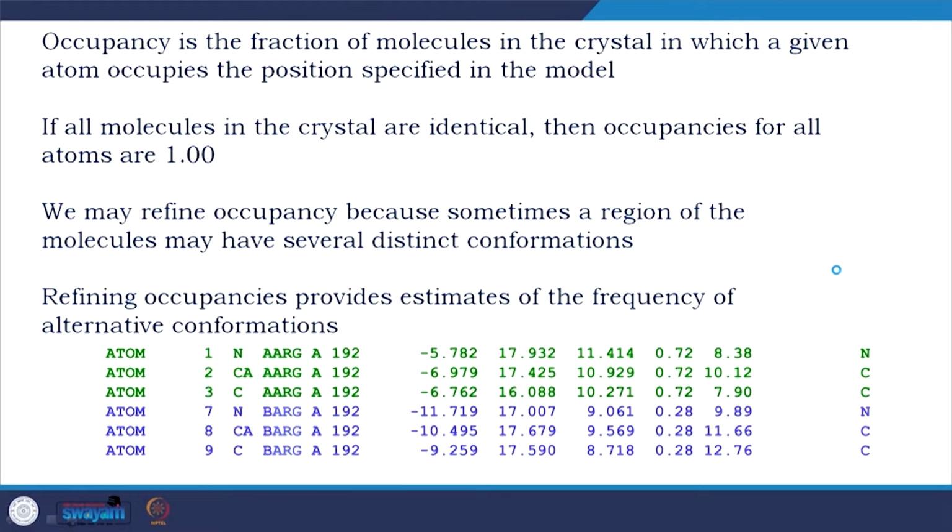Before showing this data, I want to tell you one thing. We are discussing structural biology techniques, but yet I have to introduce you to the PDB. What is PDB? PDB is the Protein Data Bank, where all the biological macromolecules whose 3D structures are solved are deposited.